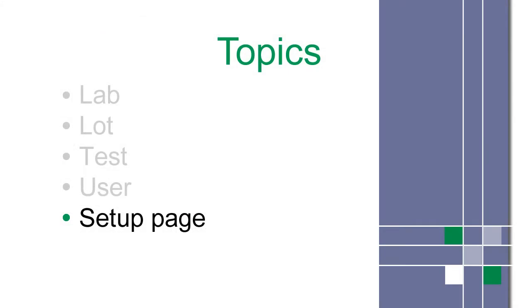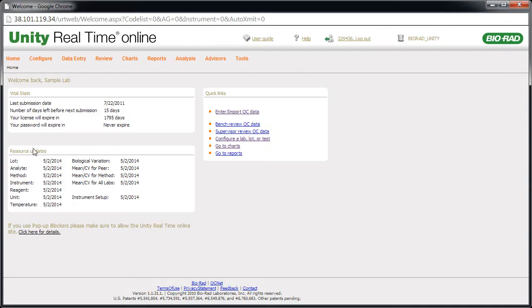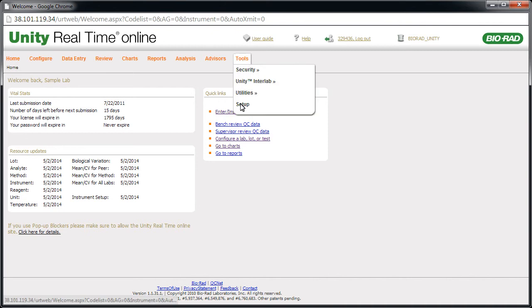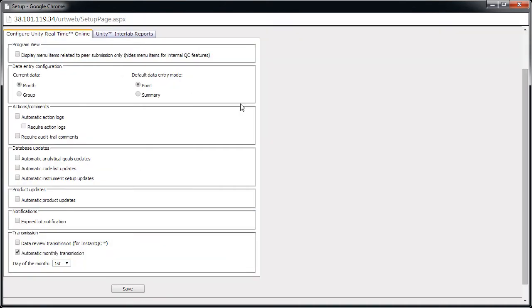Next, we recommend that you verify the settings in the Setup page. This allows you to take full advantage of the software's capabilities. Point to Tools and click Setup. The Setup page allows you to customize the software, including automated notifications.